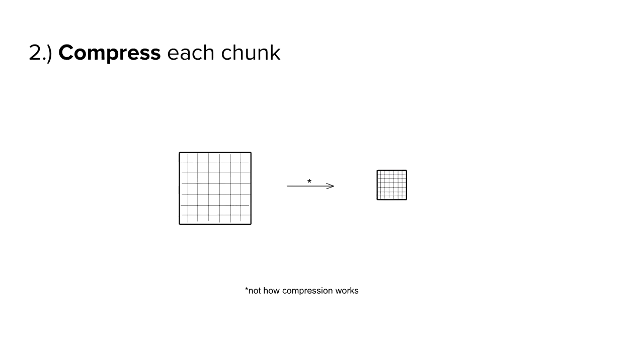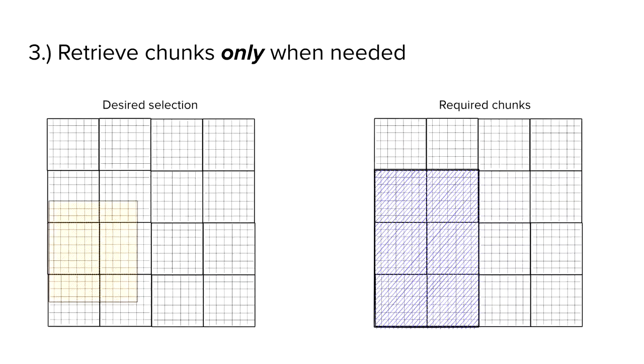And a very important part about Zarr is that each of these chunks is given its own unique identifier, or a key. And so in contrast to some of these larger imaging formats, a Zarr dataset can be stored in any sort of key-value store rather than just a single binary file. And then once you have these separated chunks, when you want to access the data, as shown here on the left, you only need to read that part of the data that's been written to disk and not all of the data at once.